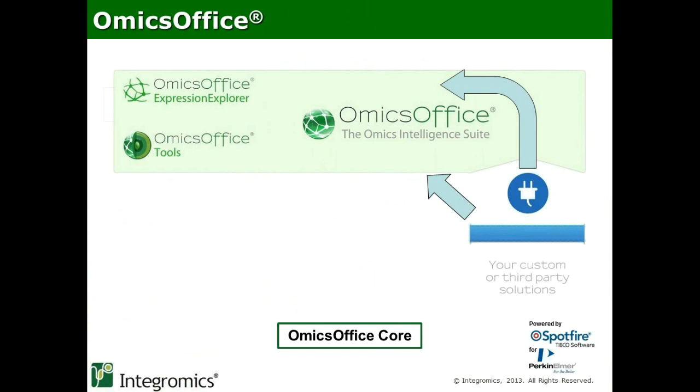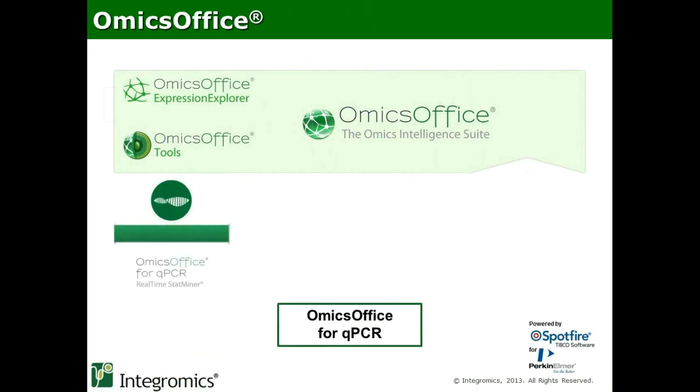In any case, once we load our third-party data into the OmicsOffice, we can also use the ExpressionExplorer, which will provide us with a set of visualizations and analysis in an automated way that will help in the exploration of the data. And the OmicsOffice tools can be used for any other type of analysis. We will go into more detail in the demo at the end of the presentation.